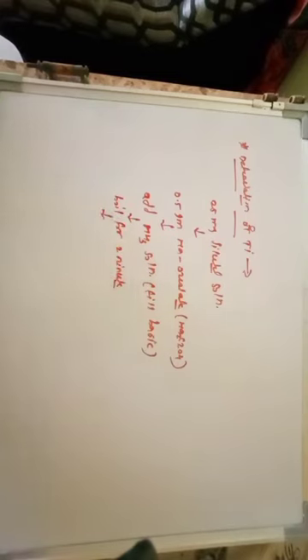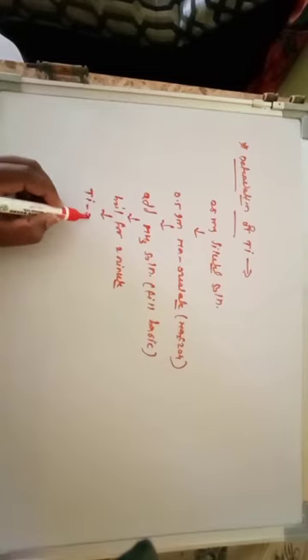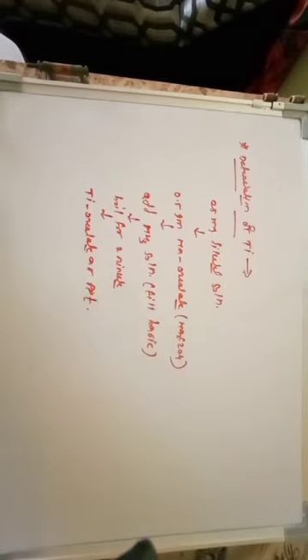There is a formation of titanium oxalate as a precipitate. So you take the diluted solution, add sodium oxalate, add ammonia till the solution is basic, boil the solution, and titanium oxalate forms as a precipitate.